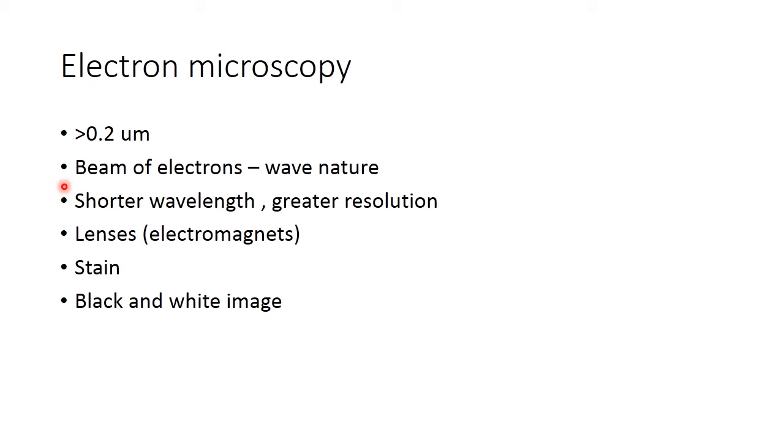When the beam of electrons is deflected, this is recorded by a detector. Based upon the nature of scattering, the angles of scattering, a particular image is produced. All this data is recorded onto a computer, and then the data is processed, which in turn is used to produce the image of that specimen.